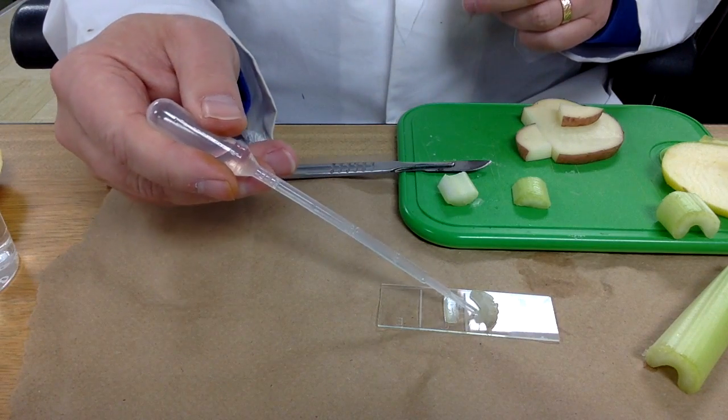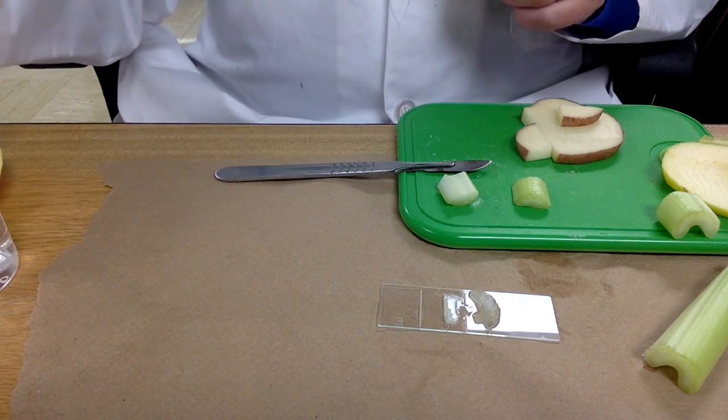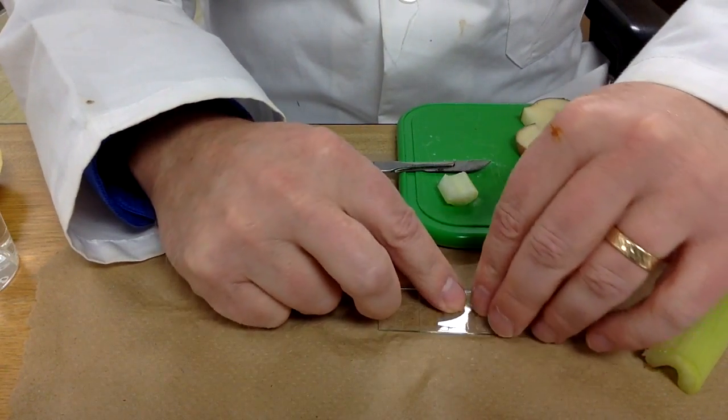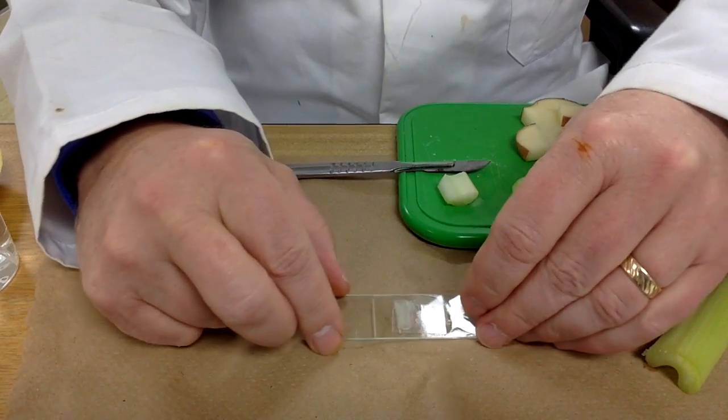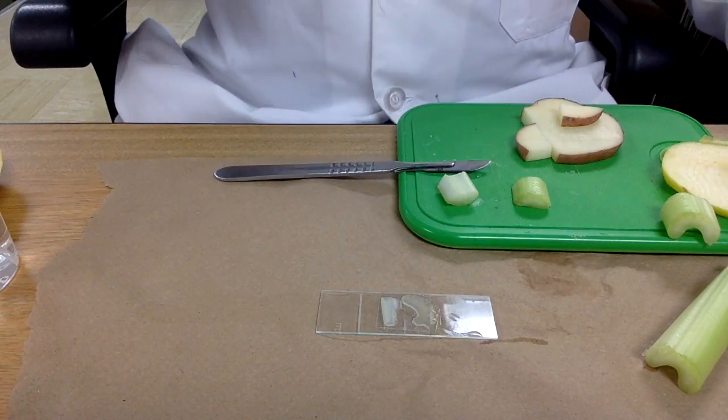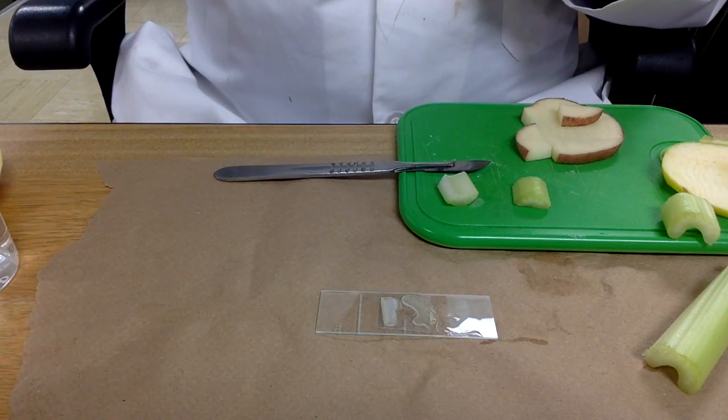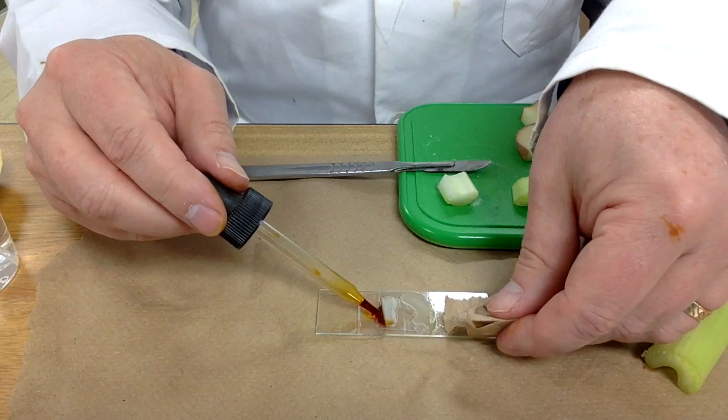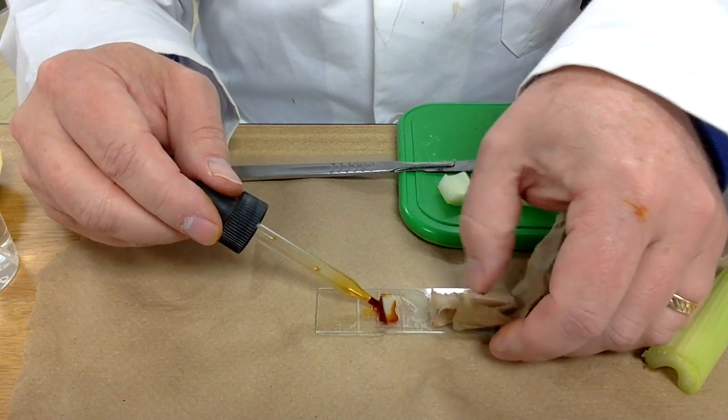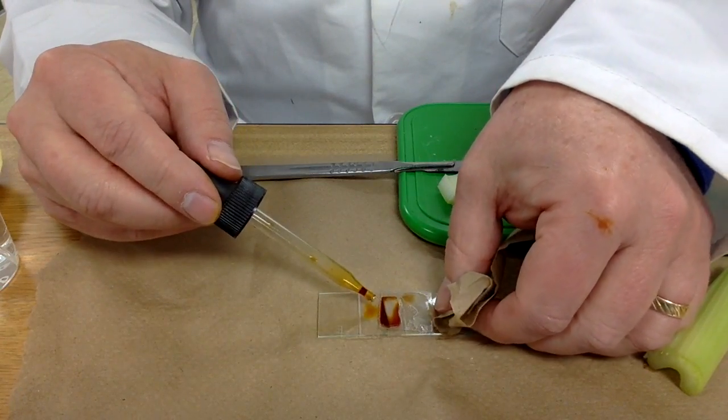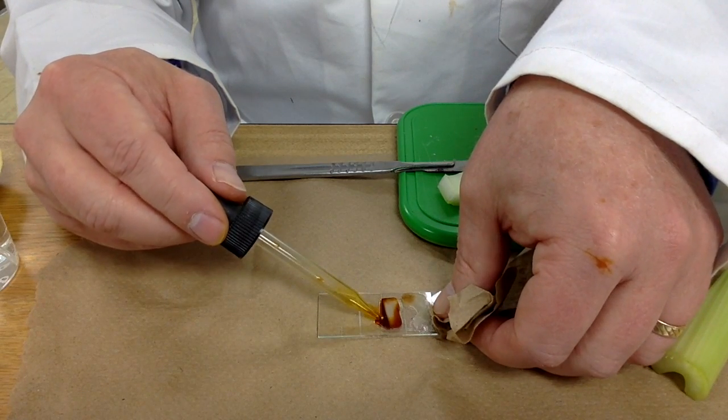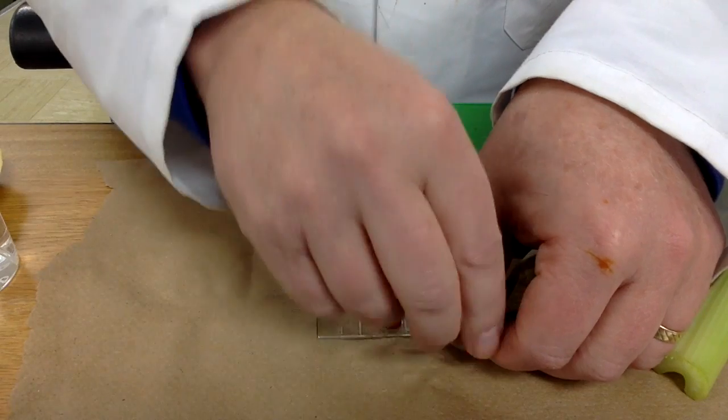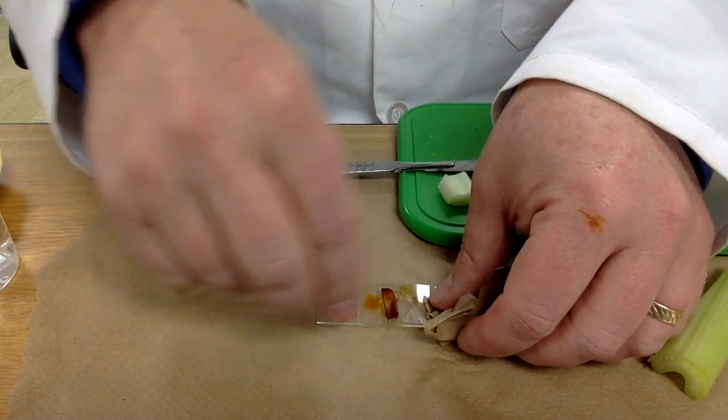Add some water, put on a cover slip. And again, after viewing that under the microscope, you can add some Lugol's iodine solution and use a paper towel to help pull that across to stain your samples.